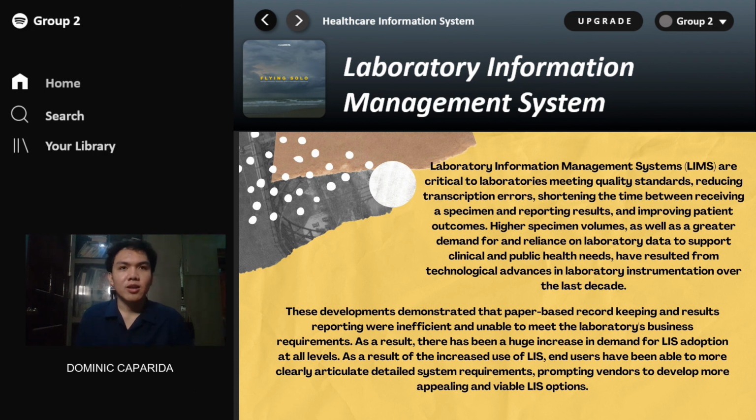So that's what LIMS software is all about. This still ensures the capacity of managing and storing the data and the accuracy of test results from samples.